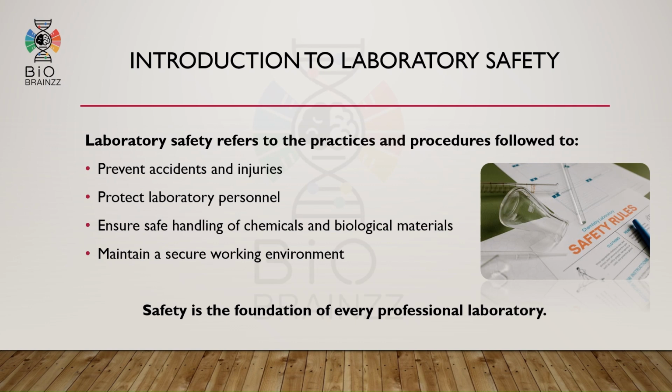First, let us understand what laboratory safety means. Laboratory safety includes all the practices followed to protect laboratory personnel, equipment, samples, and the working environment. Safety procedures help prevent accidents and ensure experiments are performed in a controlled and professional manner. Without safety, no laboratory can function properly.